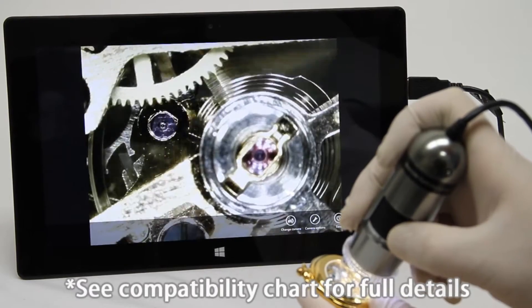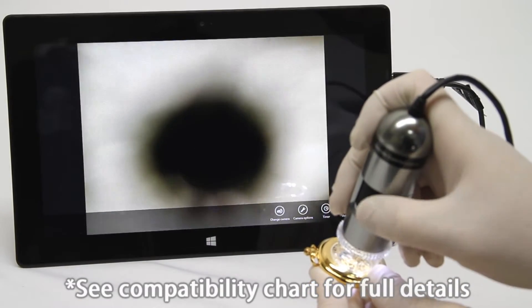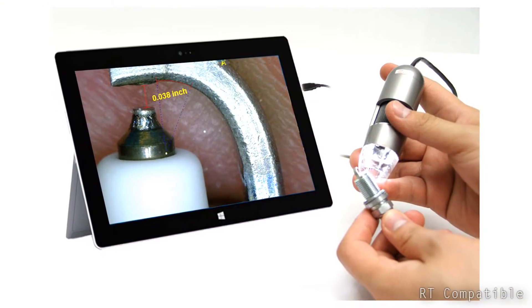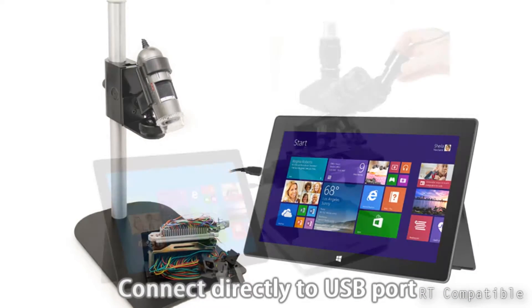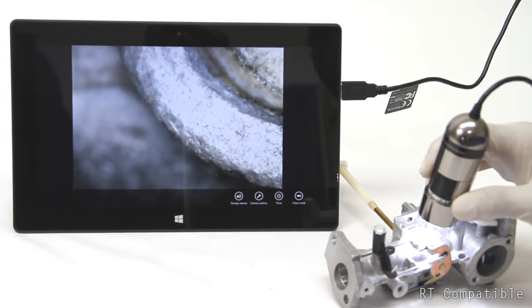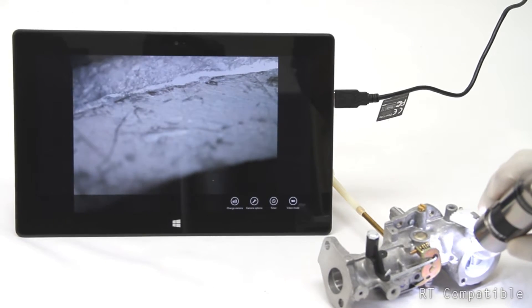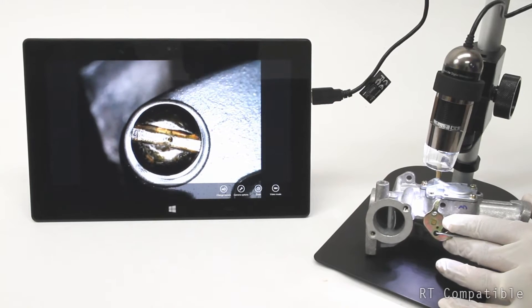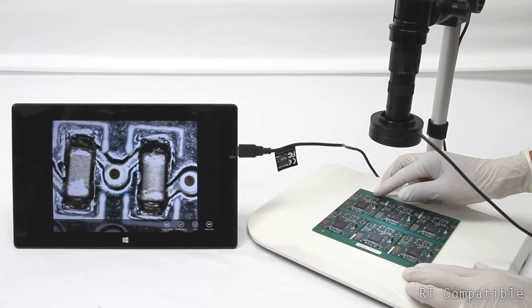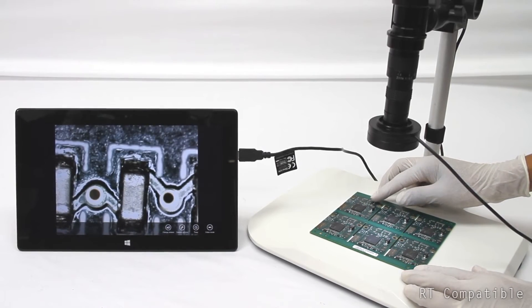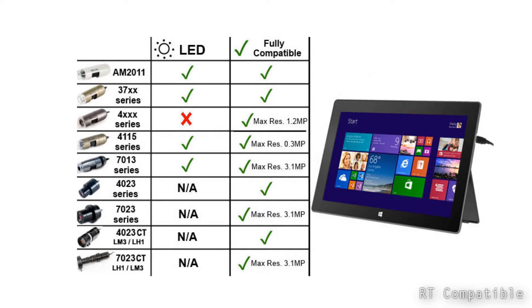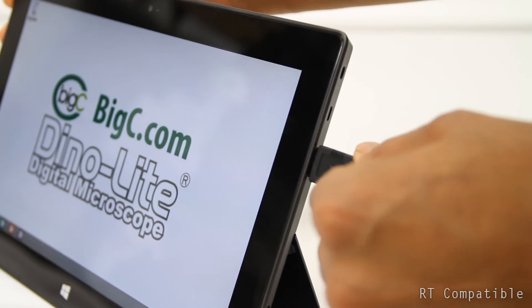Dino-Lite USB digital microscope cameras are compatible with Windows RT tablets. Users can perform live viewing and inspections with the ability to capture images and video. This is the compatibility chart for Dino-Lite devices and Windows RT tablets.